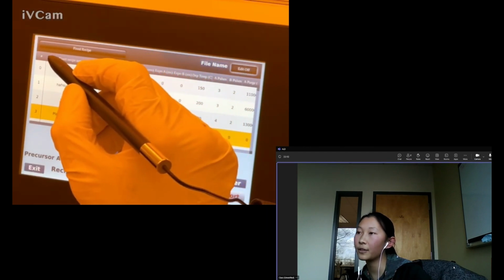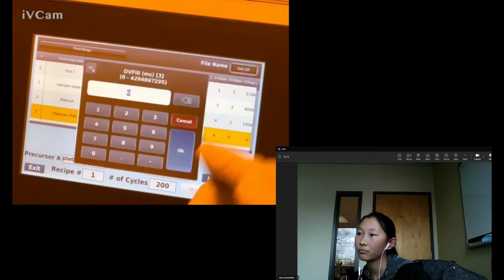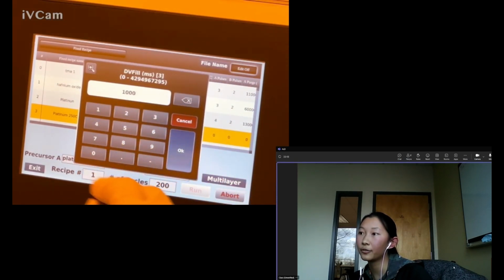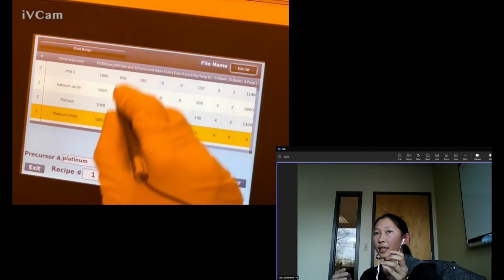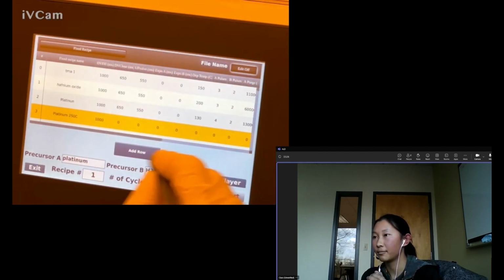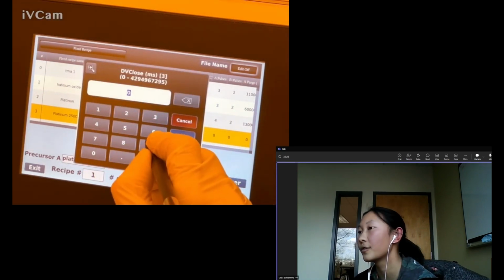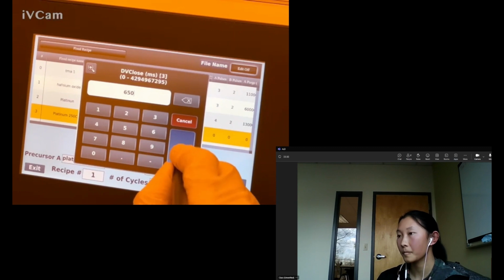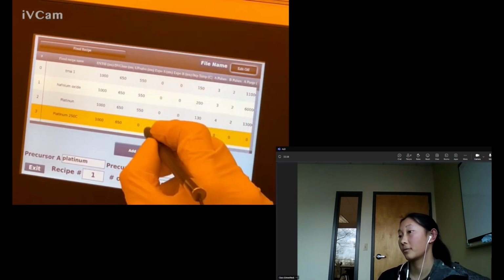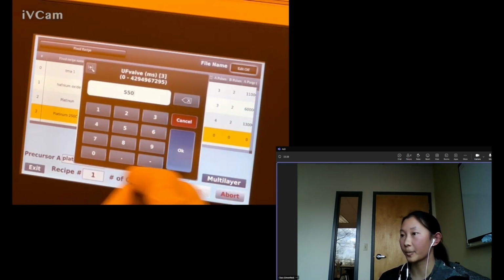So the DV fill should always be 1,000. What is the DV fill? That's the dose valve fill. It's filling for 1 second, pulsing from the bottle to the dose valve. DV close is 650. All those values should be the same, and these are the same values that are on the setup page. You can experiment with different values, but the default works pretty well.